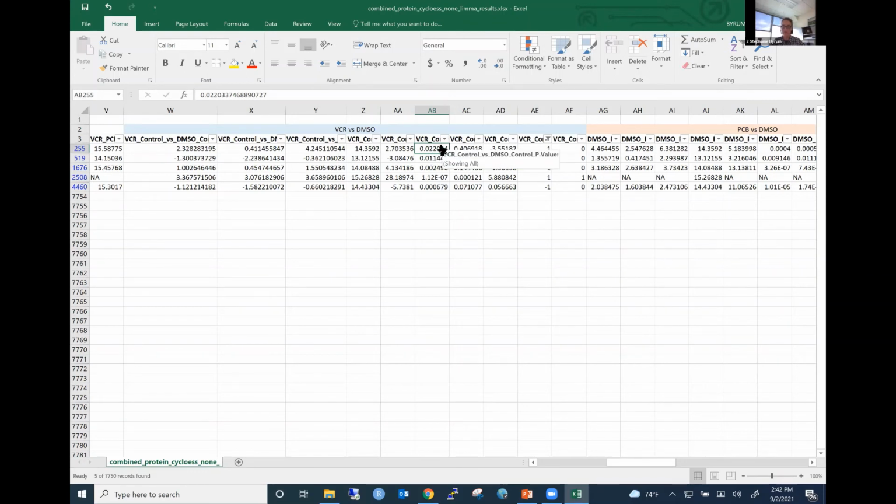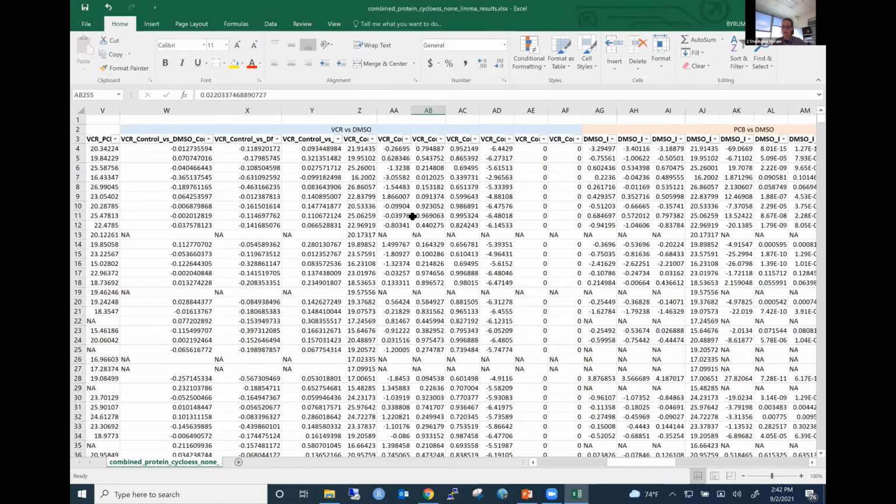So when I'm doing a pathway type analysis, I'll tend to expand the significance to include anything with a significant unadjusted p-value and not the more stringent cutoff, if that makes sense. Because for the pathway, I'm trying to include more molecules in order to do a better pathway analysis. But it is interesting to look at your fold change information compared to the confidence intervals. So if this particular one goes across 0, you have a negative and a positive value. So for that one, your unadjusted p-value is actually not significant, and it's reflective of that confidence interval.